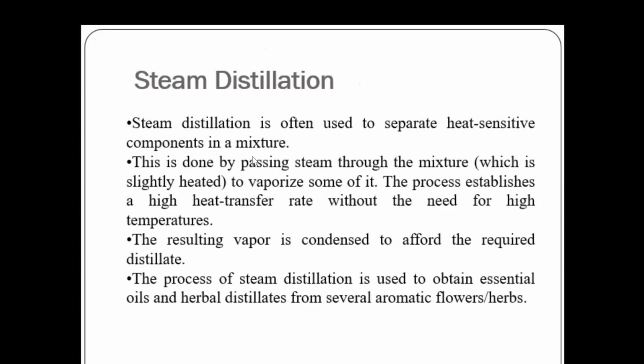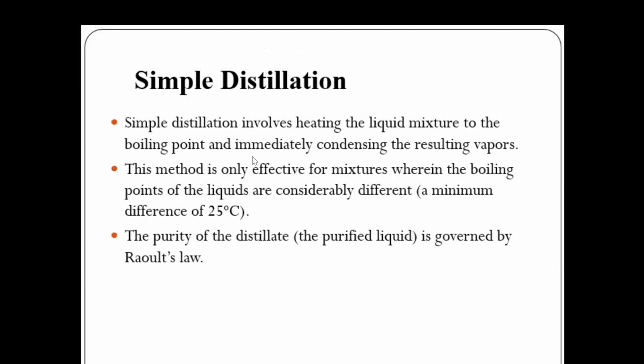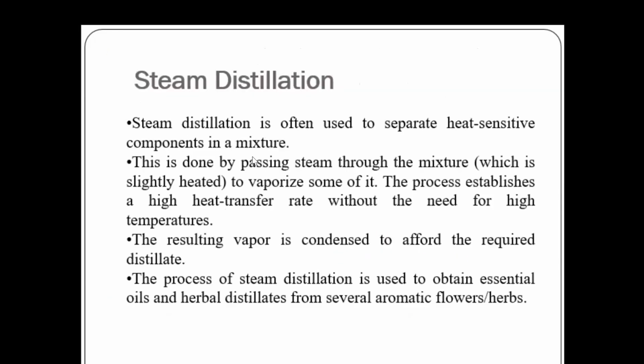So, steam distillation. Distillation is of different kinds: one is simple distillation and another is fractional distillation. If you look at steam distillation, it is often used to separate heat-sensitive components in a mixture. So if you have a heat-sensitive component in a mixture, then steam distillation is carried out. What is the process behind steam distillation? This is done by passing steam through a mixture.